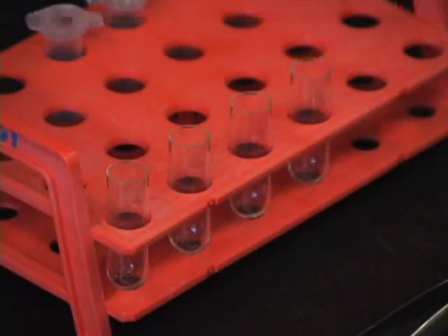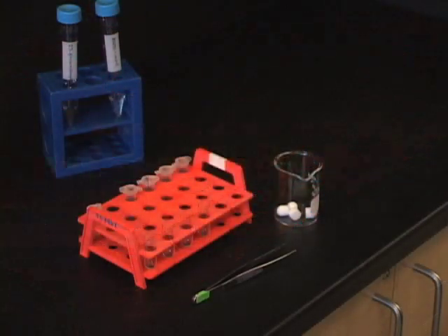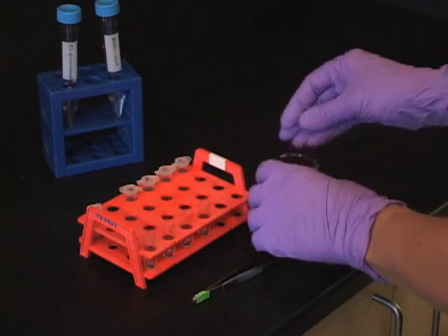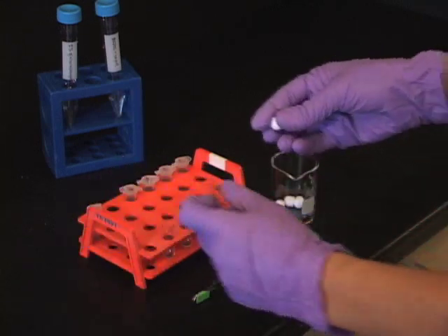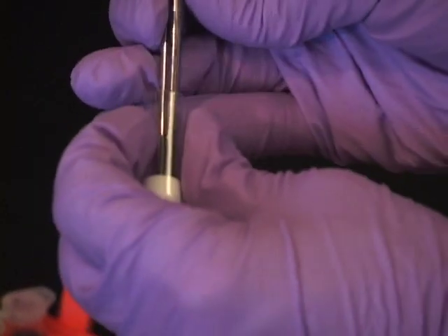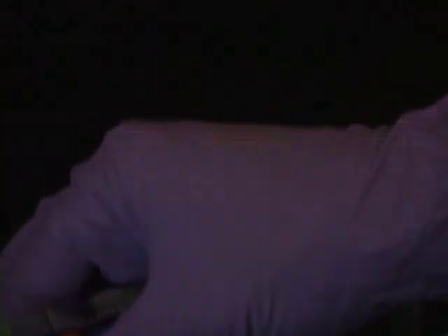Place nitric acid cleaned inserts into Beckman thin-walled ultracentrifuge tubes. Our inserts are custom-made by Ellard Instrumentation. Push down the inserts to the bottom of the tubes with forceps.